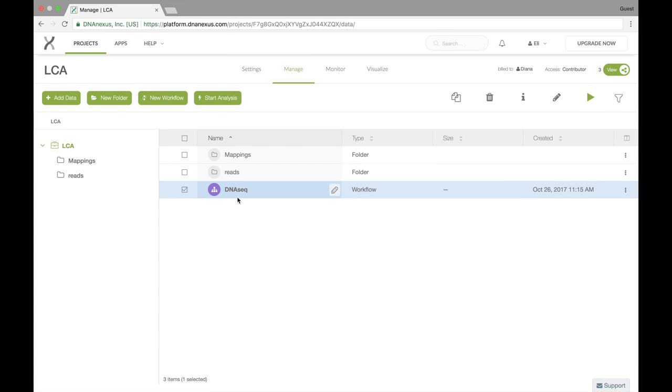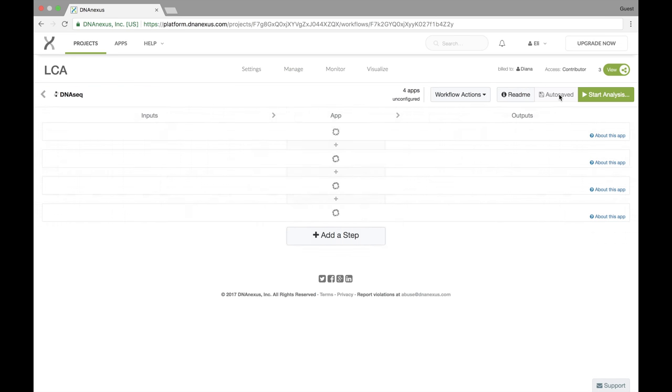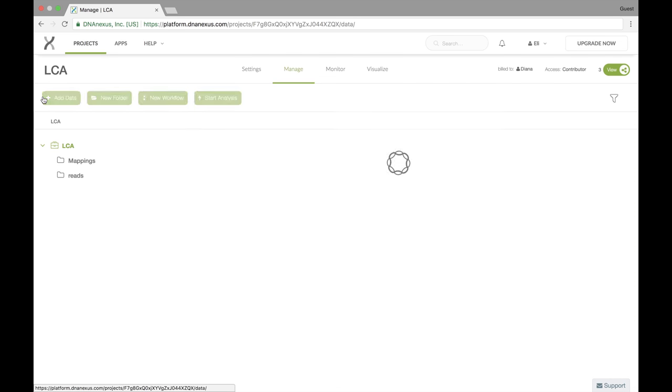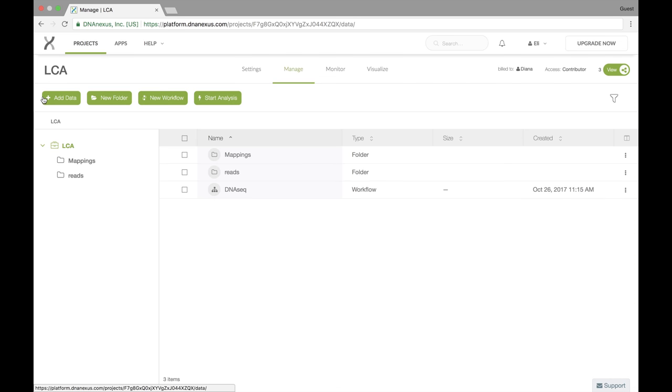Or you can select the workflow like we have now and select the pencil edit icon and that will take you back to the workflow template. We're not going to change anything. We're going to go back and actually run our workflow.